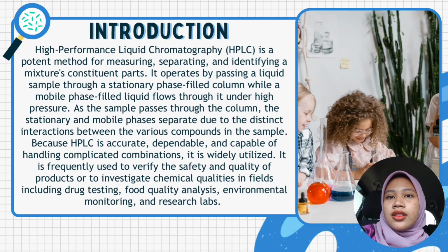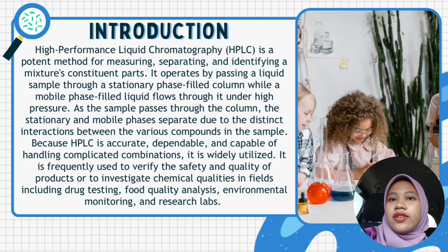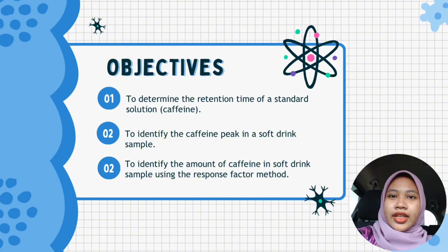Because HPLC is accurate, dependable, and capable of handling complicated combinations, it is widely utilized. It is frequently used to verify the safety and quality of products or to investigate chemical qualities in fields including drug testing, food quality analysis, environmental monitoring, and research labs.